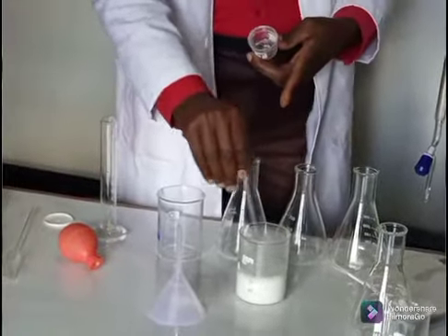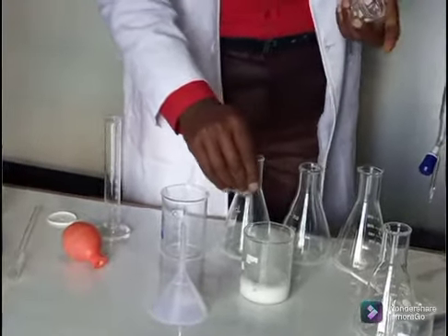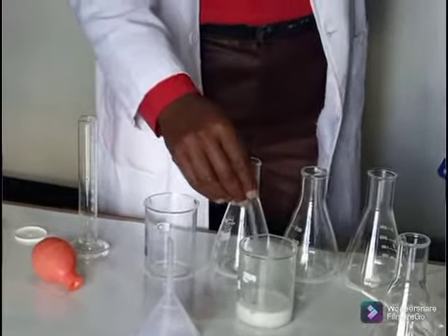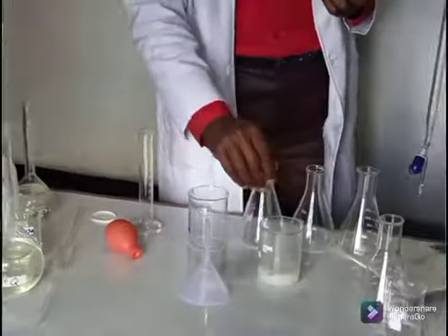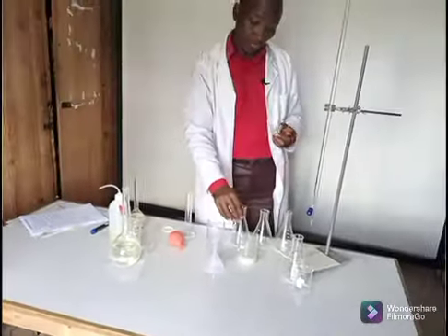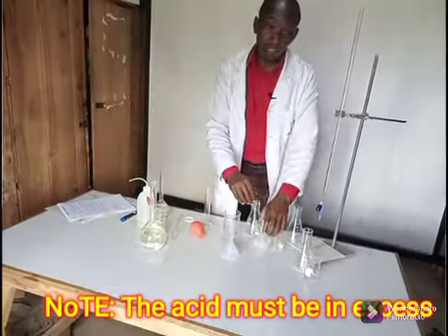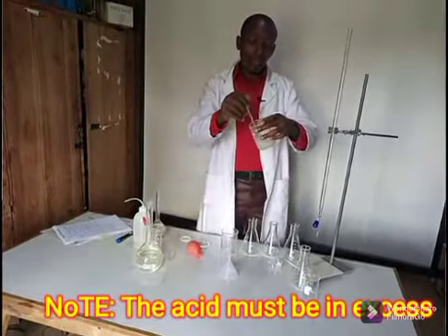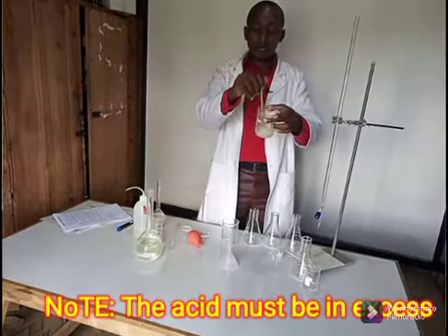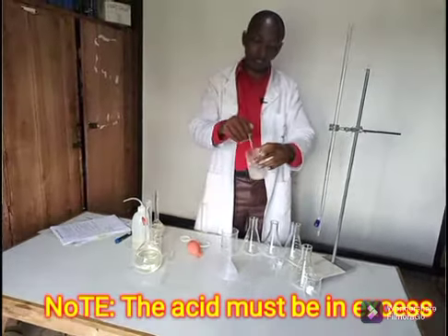So if you can observe keenly what is happening here, obviously, when a carbonate is added to an acid, there is effervescence of a colorless gas. You can see the fumes, the fizzing sound, yes? So with the back titration, we ensure that the carbonate is the limiting reagent. That tells you the acid we are working with is in excess. All the carbonate has to react.